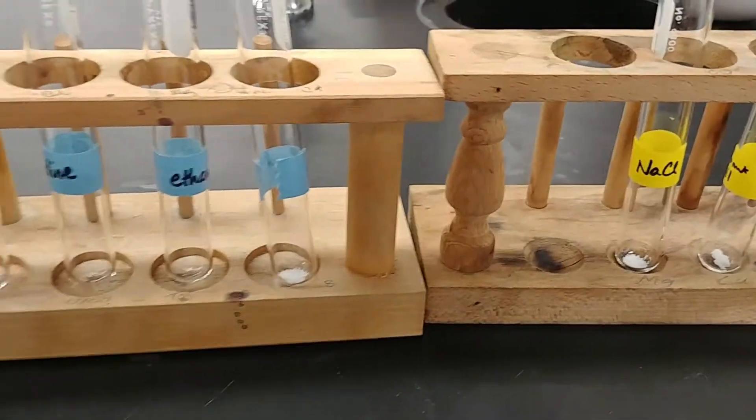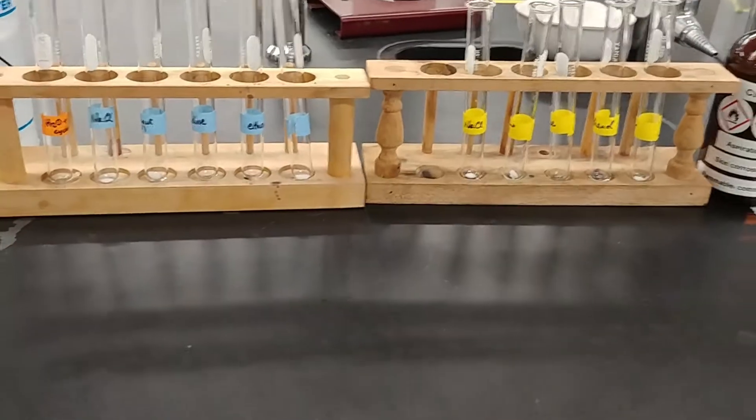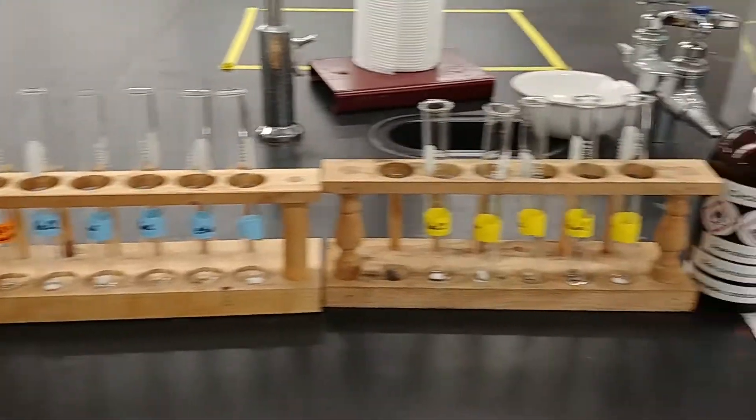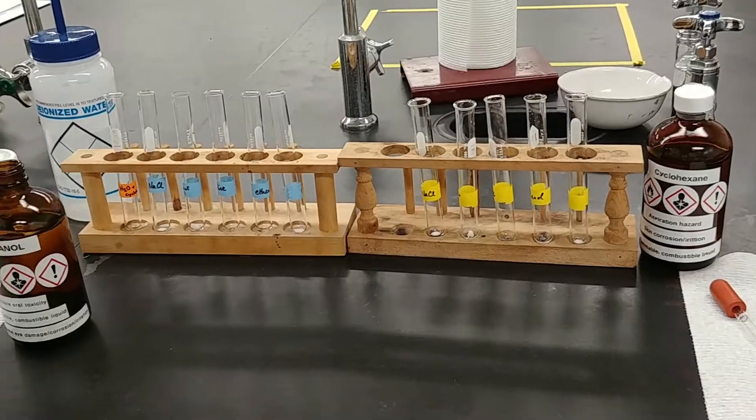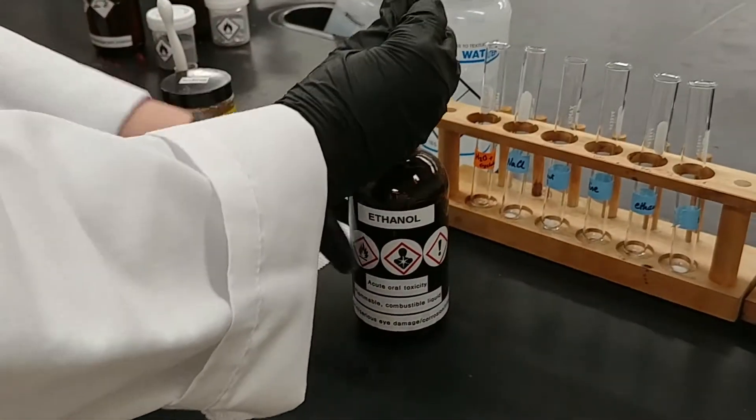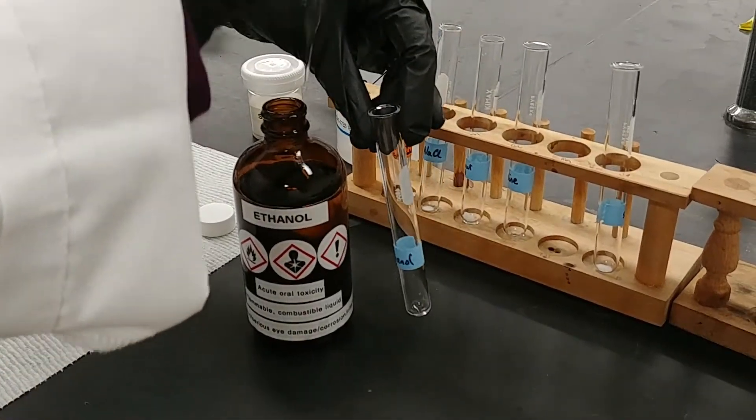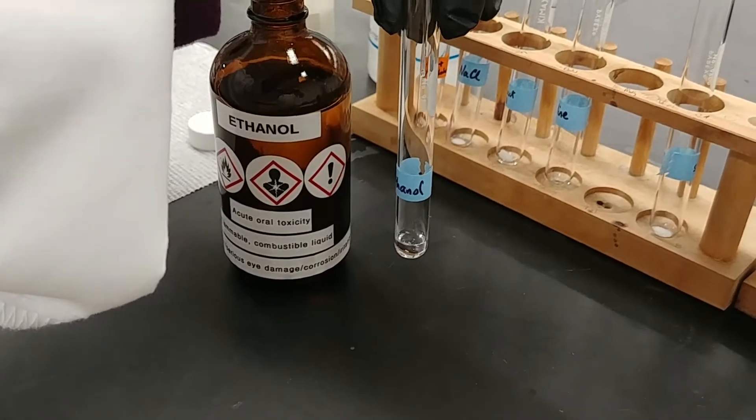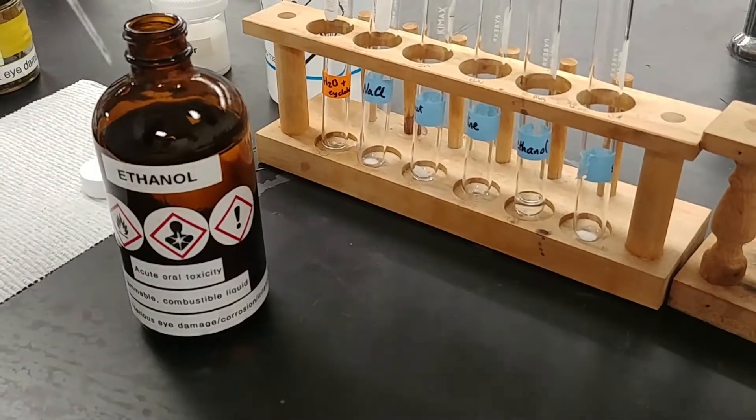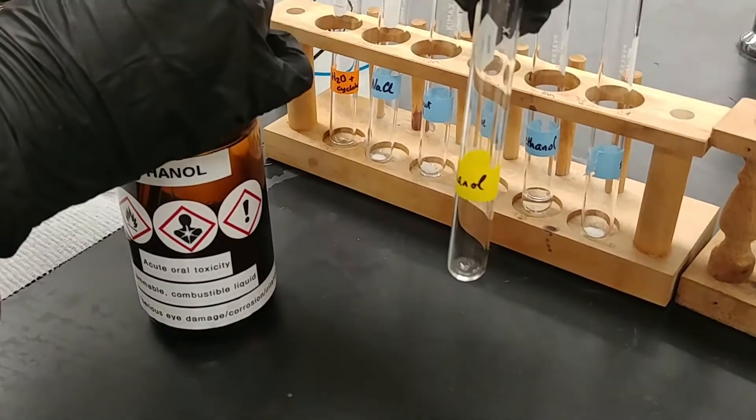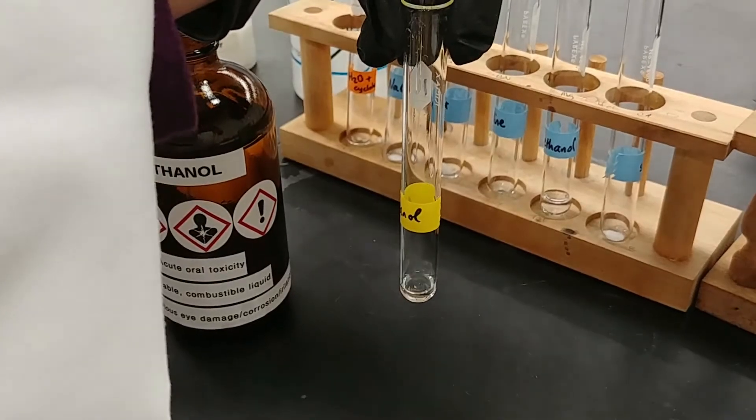Once I get the rest of the solids in here, we will be looking at adding the two solvents and comparing which one does a better job of dissolving our solutes. So I'm going to add some ethanol to my ethanol test tubes. This is a liquid solute. I'm going to add about one milliliter to each of these test tubes so we can see by comparison which solvent does a better job.